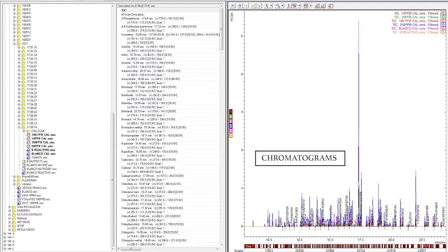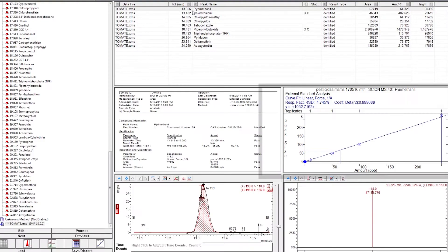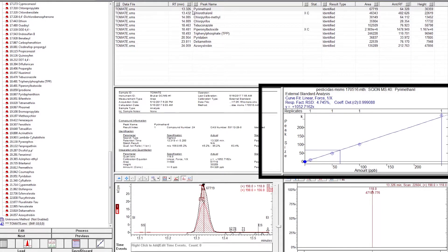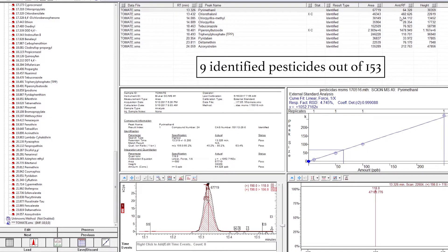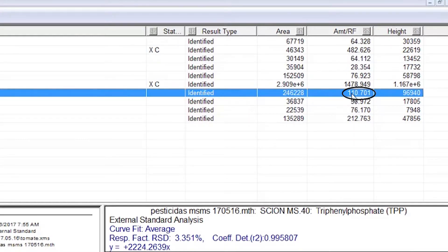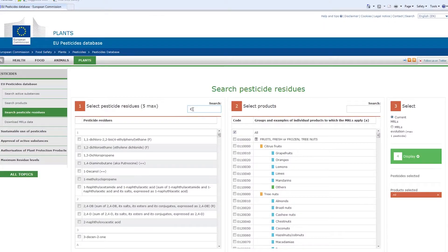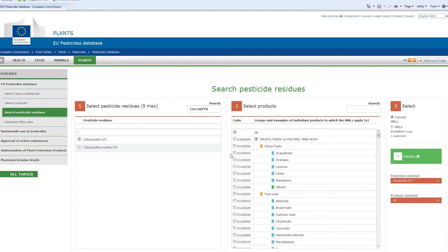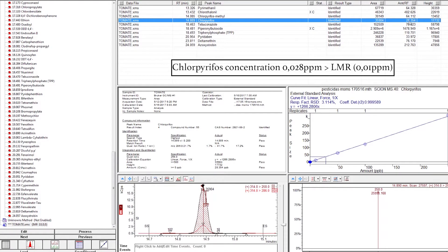When processing the data, we overlap the chromatograms corresponding to the calibration standards, observing the increasing signal of the chromatographic peaks at the different concentrations. Calibration curves are built up for each of the 153 pesticides, checking that minimum requirements such as curve linearity and RSD value being less than 20% are met. In the tomato sample, 9 pesticides out of the 153 analysed are detected and quantified. We verify that recovery of the internal standard is adequate, that the minimum identification requirements are met, and that the concentration is within the calibration curve range. We look for each pesticide in the European Commission database, specifically in tomato, and the maximum value established is displayed. In the case of chlorpyrifos, this limit, or MRL, is 0.01 ppm, or 10 parts per billion. The sample quantifies 0.028 ppm, which exceeds the maximum allowed limit.